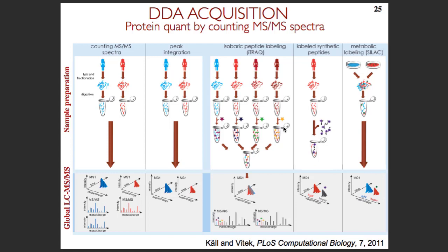And the important difference, so on one hand, we can mix samples from multiple sources within the same run. The important difference is that at the level of MS1 peaks, all of these samples generate the same precursor. The difference in quantification occurs at the level of MSMS spectra, where now each of those different sources have different reporter ions. And the height of the peak from the reporter ions inside MSMS spectra, this is what is used for quantification. And this has really fundamental differences. This is why we could not use it in MSstats before. And the differences are just from the data processing perspective.